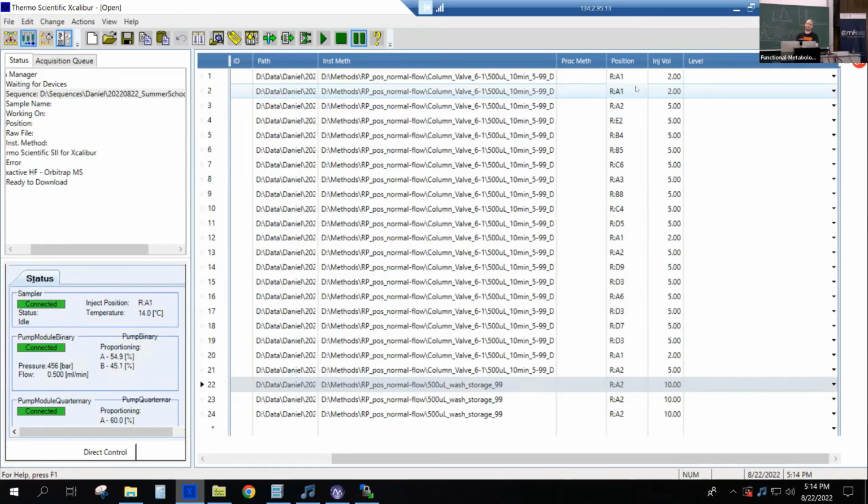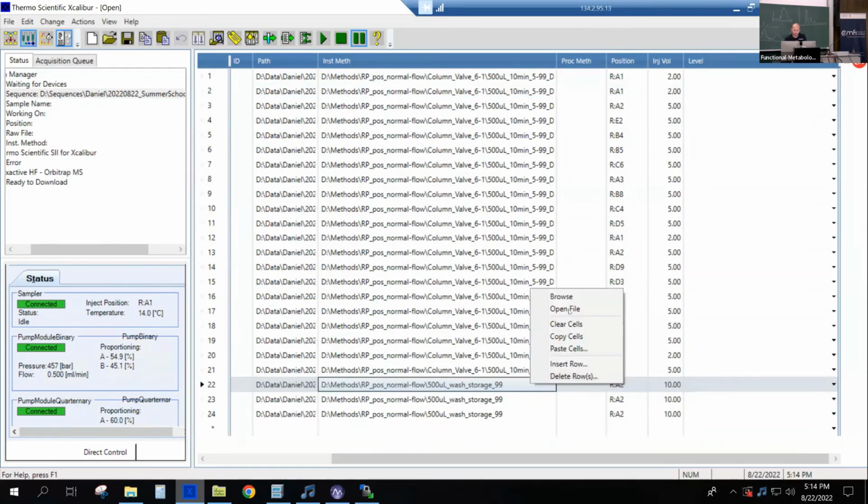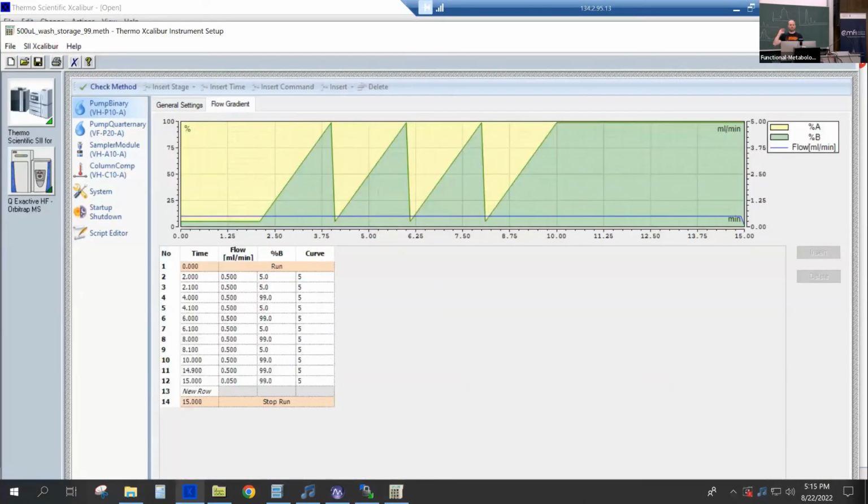Also, short question. In the washing phase of the chromatography, do you also acquire the MS2? No, no. I can show you how. Yeah, let me show you that method too. That's only MS1, and we basically just delete it afterwards.